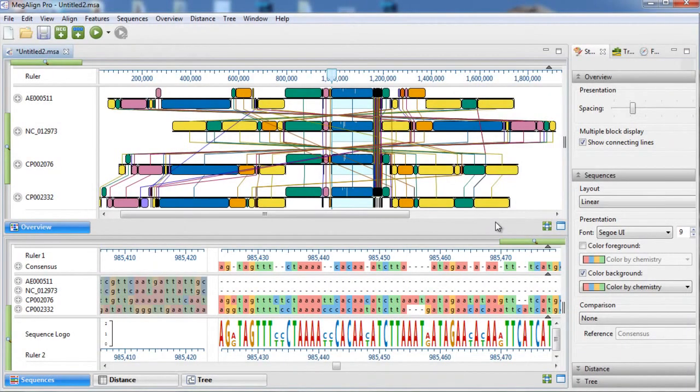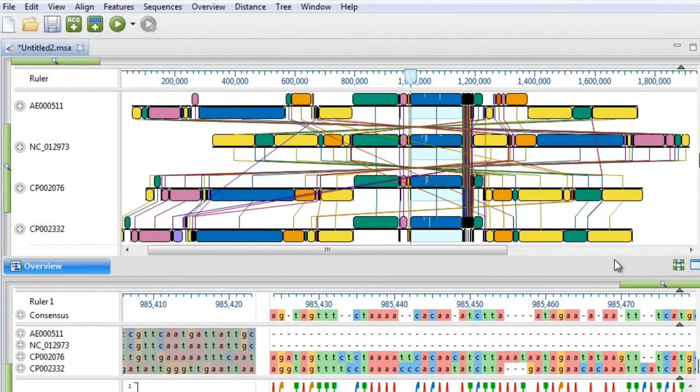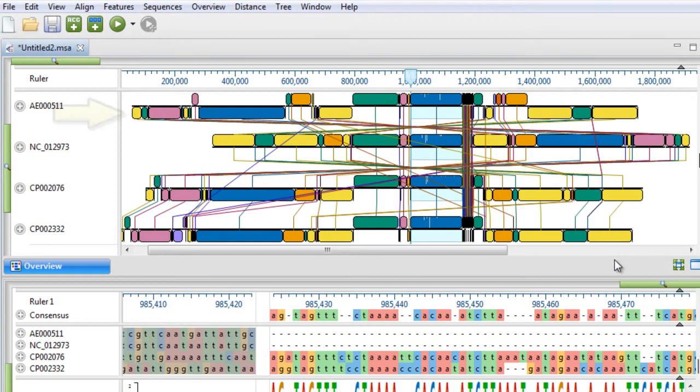After alignment, you can see that the genomes are displayed in the overview panel as locally collinear blocks, each of which is a conserved region across multiple sequences. We can see that some of the blocks are on the opposite strand, indicated by hanging below the black line, which can be the result of rearrangements such as inversions.